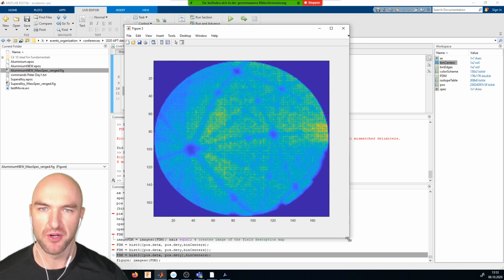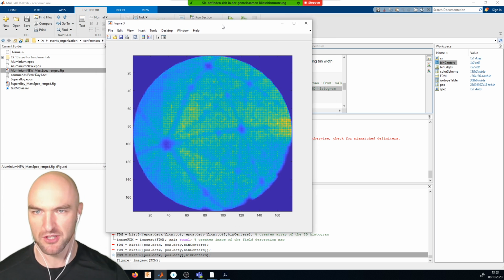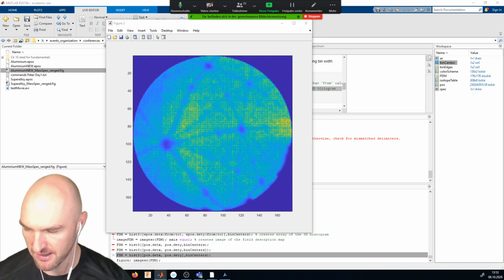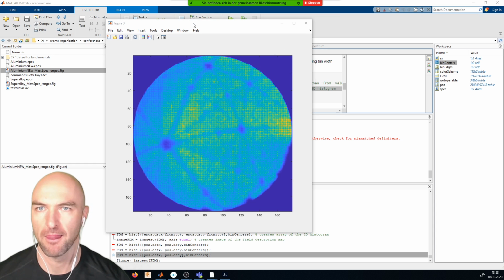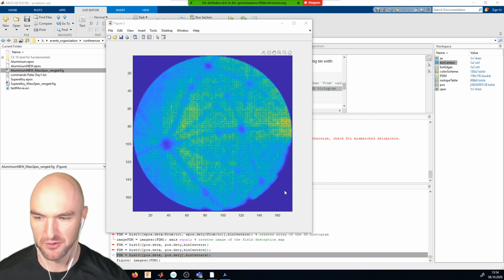Does every one of you know what a field desorption map is? One thing you can see here, by the way, a field desorption map is essentially a density map of hits on the atom probe detector. And unfortunately, when everything crashed before, I just lost my... Ah yeah, no, I didn't lose my sketch from before, that's great.